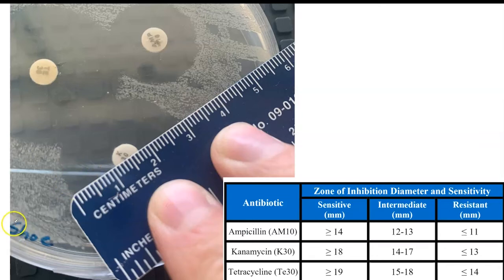Now I'm zoomed in, so you can still see this is the shoe plate. And now what I've done is I've overlaid a ruler, specifically using the centimeter scale. But more importantly, we actually want to use not centimeters, but millimeters. So that's the unit we want. Each one of these little marks is 1 millimeter, and if you add up 10 of those, then you get to 1 centimeter. And so this is 3 centimeters.